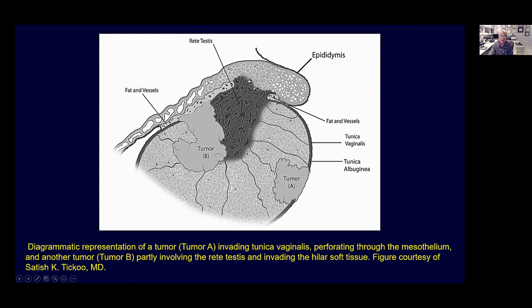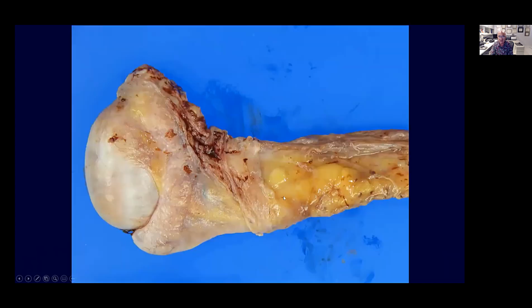And also take care of the tumor when it's close to the rete testis or the epididymis, and also in the spermatic cord, which increases the possibilities for dissemination as well, or even in the fat tissue.